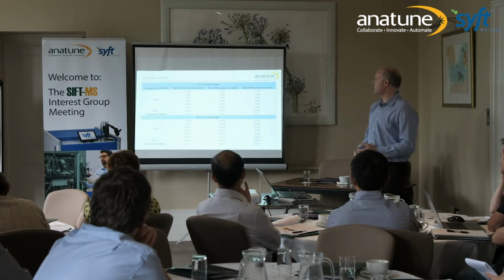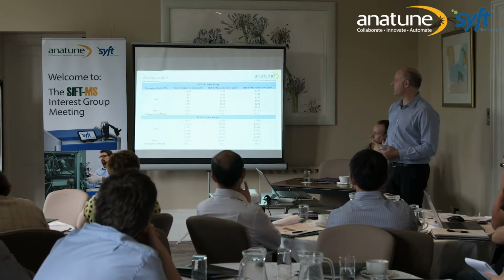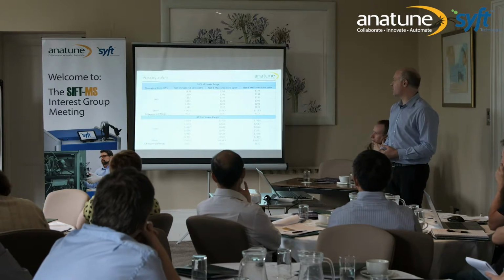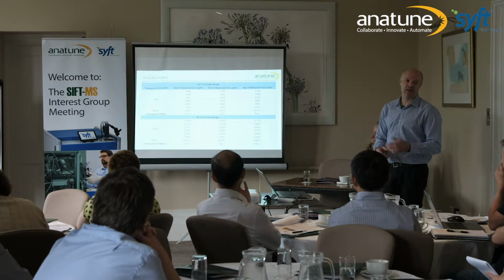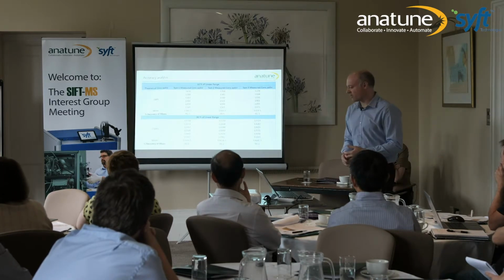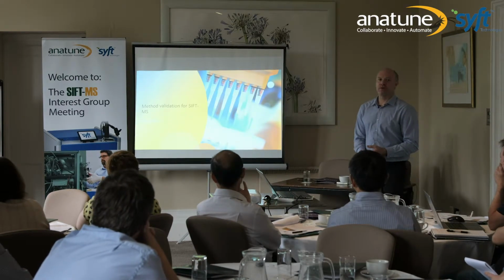So here we see the data, very similar to the precision data, at 10% and 90% of the linear range of the method, and again we're seeing really good recoveries, at least 90% plus of the analyte being in the bag. I would say that looks quite accurate to me. Next step of the ICH validation process is robustness.